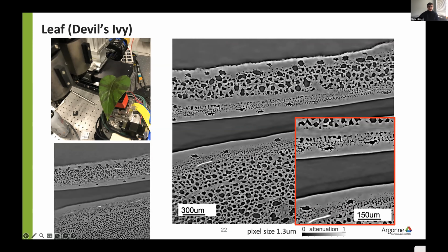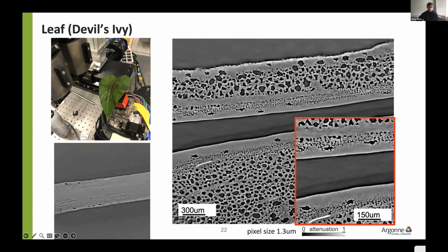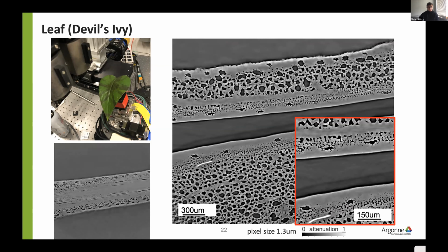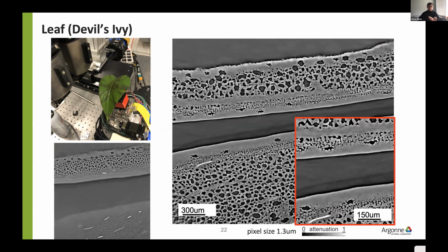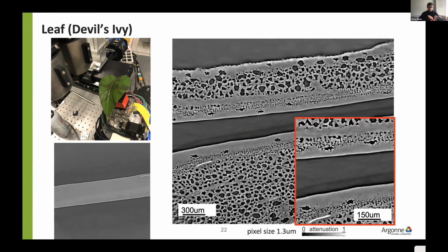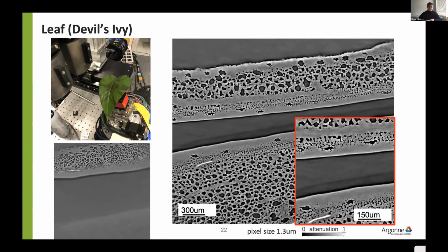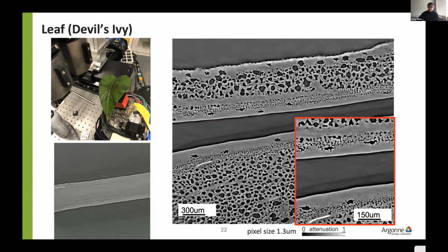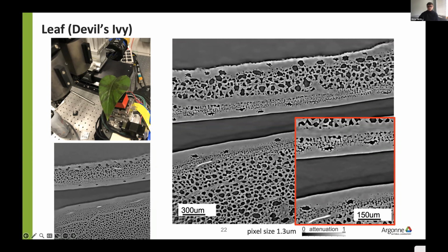Here you see the reconstruction. We go through slices. You see some bright lines here. I guess biologists should understand what it is. The region I scanned here is the region near the stem. These are parts of the leaves coming to this stem, and there is some bright, high density stuff there that I hope you know what it is. I'm talking about this bright thing here.